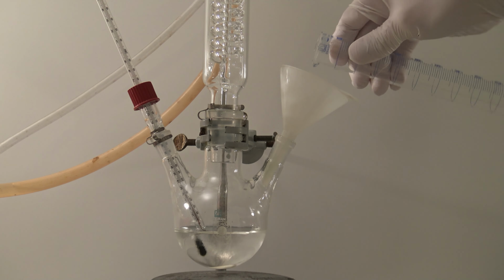When the mixture had reached 10 degrees C, the potassium hydroxide solution was added in small portions while the temperature was watched carefully. The first drops didn't cause a significant rise in temperature, so a few more drops were added. After that, the temperature rose slowly, but only by 2 degrees C.